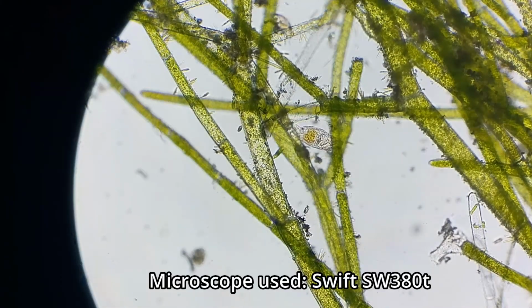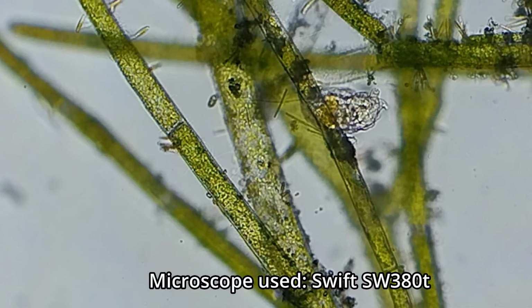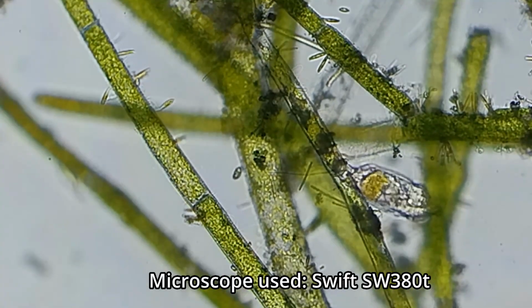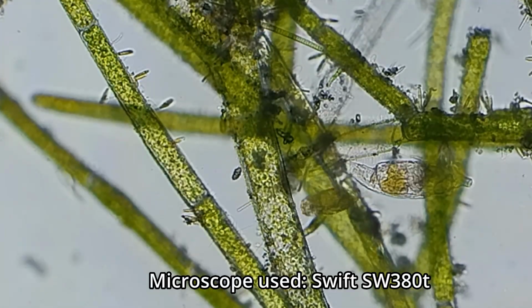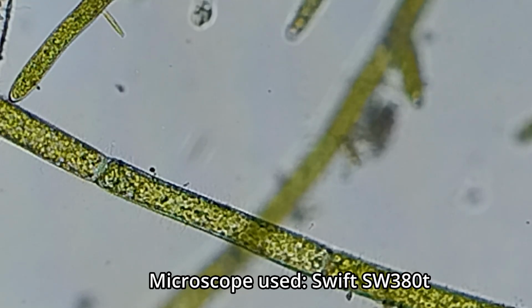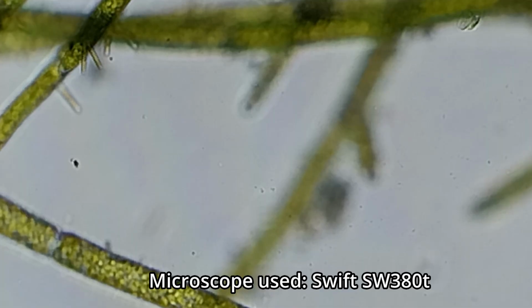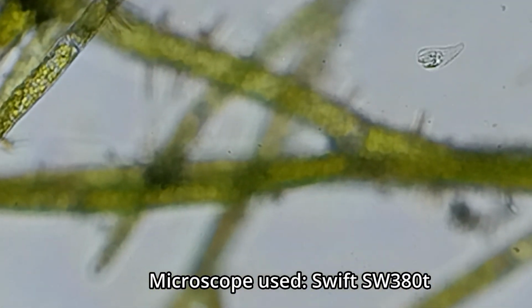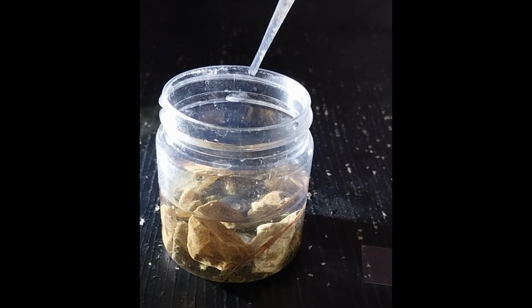Let's move on to the next sample. This sample is the one with balls of macroalgae. Aside from the large amount of macroalgae, I was able to find these rotifers. One of them is a bdelloid rotifer, and the other one is a monogonont rotifer. The smaller rounder one is the monogonont rotifer. I also saw this weirdly shaped ciliate. It was swimming around and hiding in the macroalgae. On to the next sample.